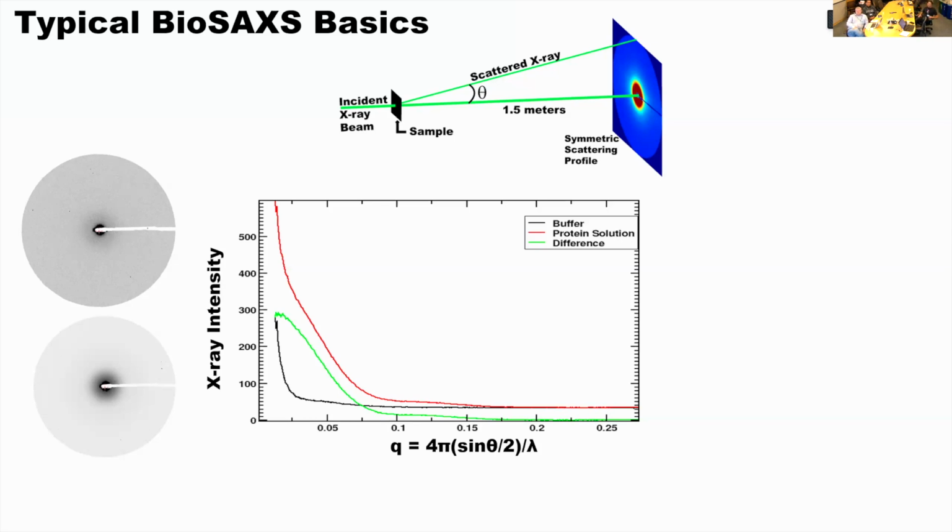And so all the tiny amounts of parasitic scattering that are coming off that aren't part of your signal have to be subtracted. So this is your sample. This is your buffer. When you subtract the two, you importantly get rid of this very dark, very bright area.